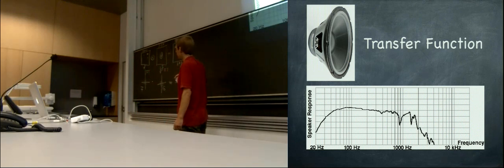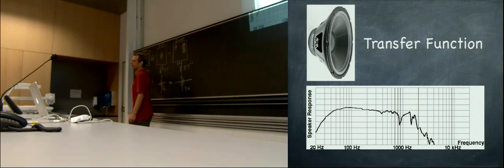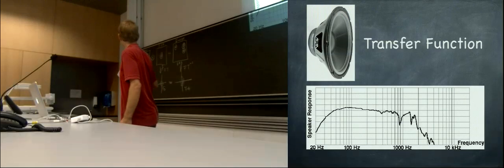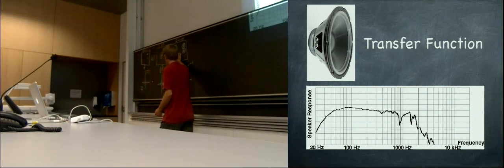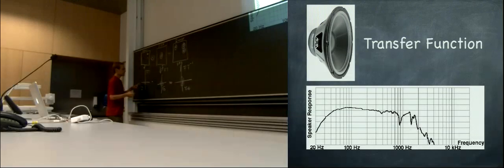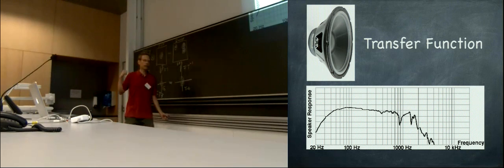Yeah? And now what we have is we record images, and what we want to know is the atom structure. Yeah, the sample. And in between is the point spread function that takes our atoms in the electron microscope to make the image. And you can also speak about this as that your Fourier transform of the atoms is multiplied with your contrast transfer function. This thing is the contrast transfer function. Yeah? And it's multiplied with your Fourier transform to give you the Fourier transform of your recorded data. We will come back to this.